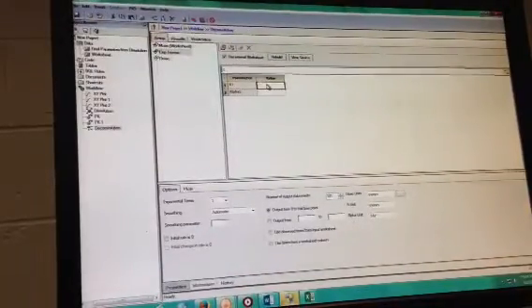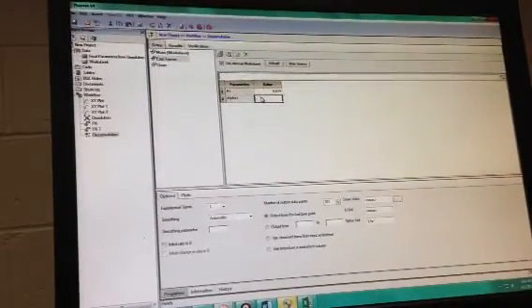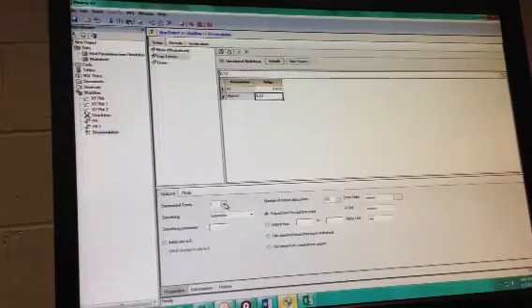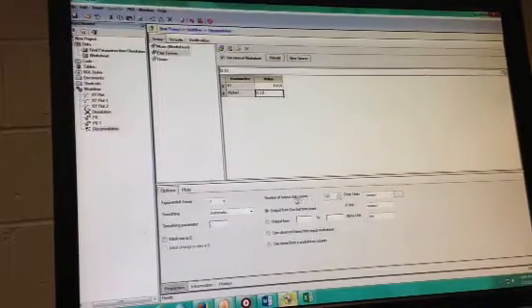One is 0.014. Alpha is 0.12. The exponential term is 1, all right? The smoothing is automatic, we leave it like that. The number of output data points, we can also get less, okay?